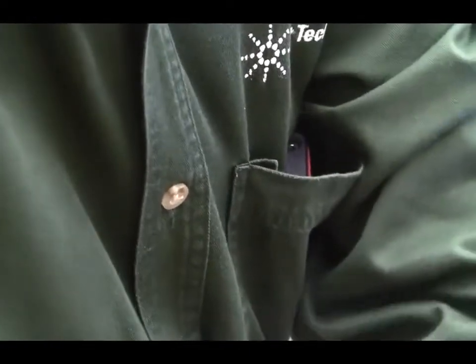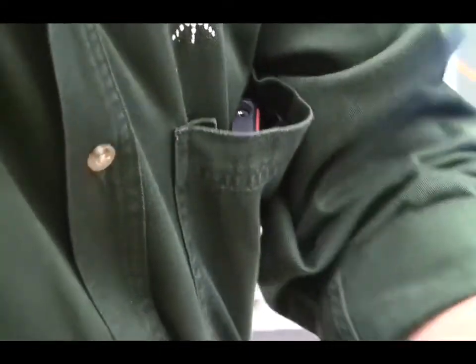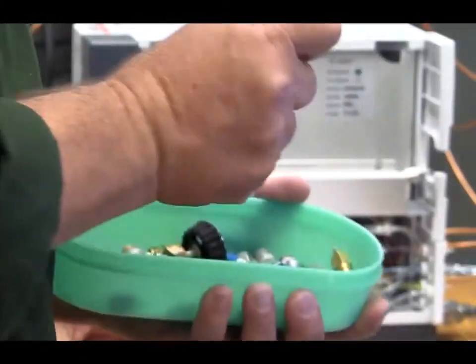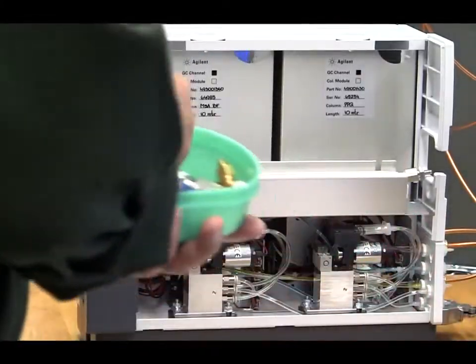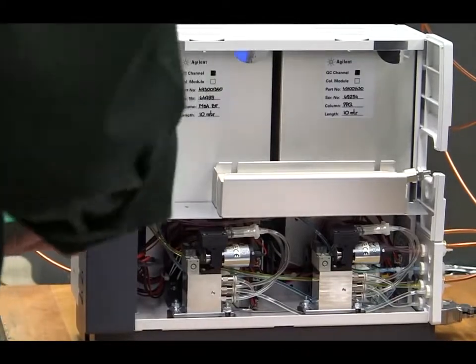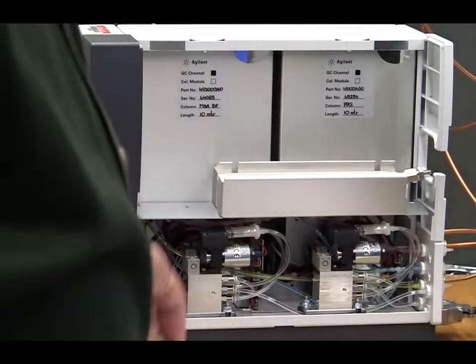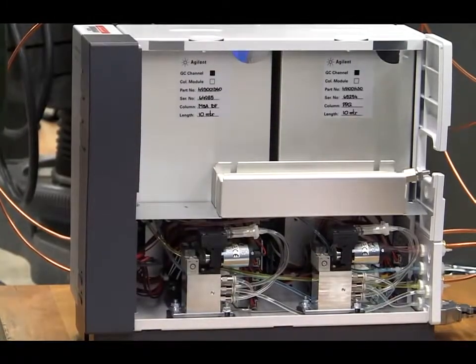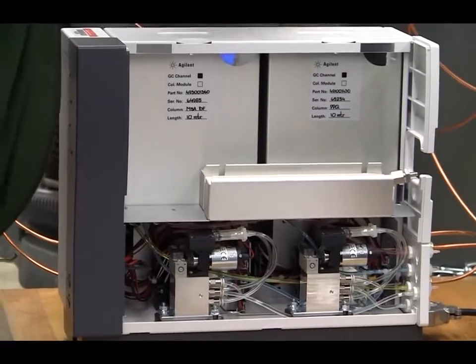A lot of people use maybe a little Swagelok like this guy. And some people use ones like this guy. Okay. Like, so that's a hook, I think. I gotta turn your gas off though. Got to disconnect everything.